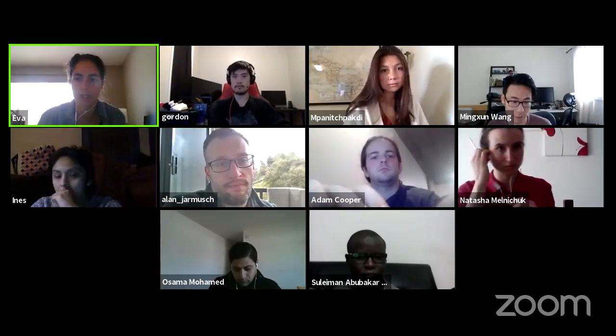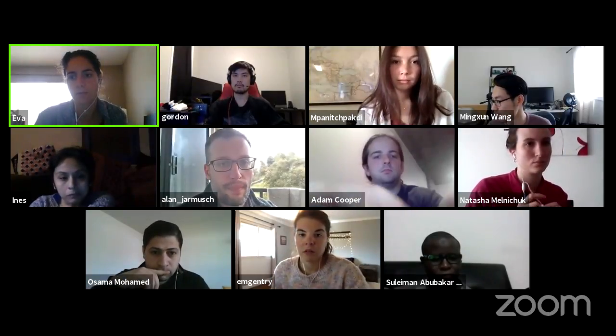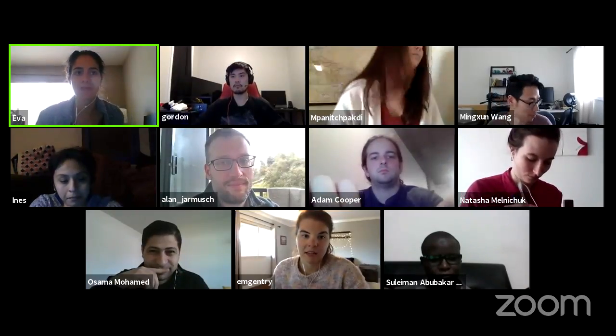So regarding this question, I work with compounds that have a very poor fragmentation pattern, and if I run them with a CID or HCD, I don't get the same fragments. But I have a standard that I want to upload to the library. So I just want to know, should I upload both fragmentations? Because then when I run my environmental samples, they may match one of them, but I don't know which.